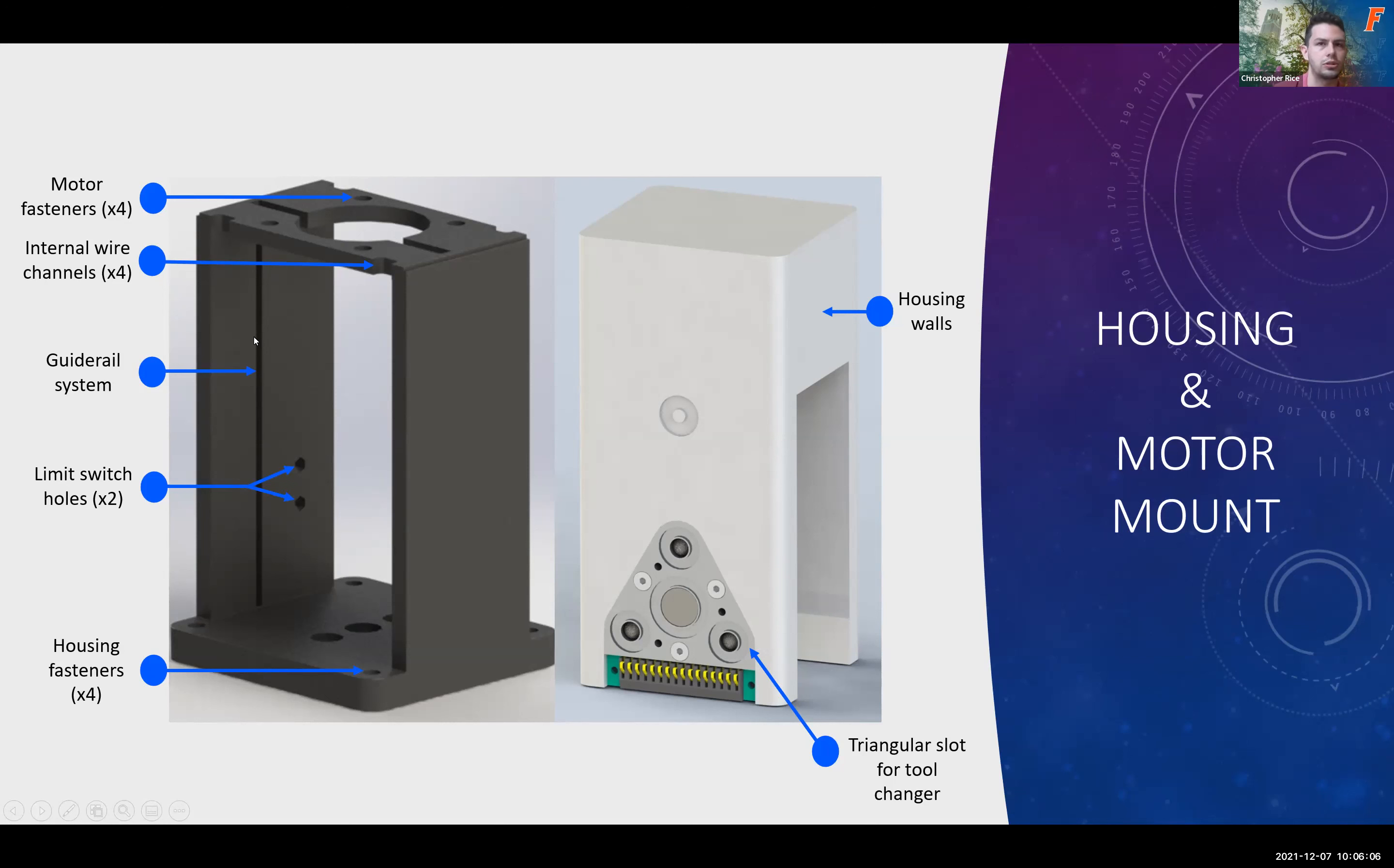Underneath that we have two limit switch holes to fasten the limit switch to the motor mount housing. This height was chosen because this is where the plunger was fully able to dispense liquid without ejecting the tip. At the base of the motor mount, we have four housing fasteners at each corner to safely secure the housing to the motor mount, and we also use threaded heat inserts for that. We also created a triangular slot for the tool changer, just to easily change out the pipette design from the bioreactor. And we also added a mini housing wall on the side of the housing to protect the motor and other electrical components from any testing fluids.